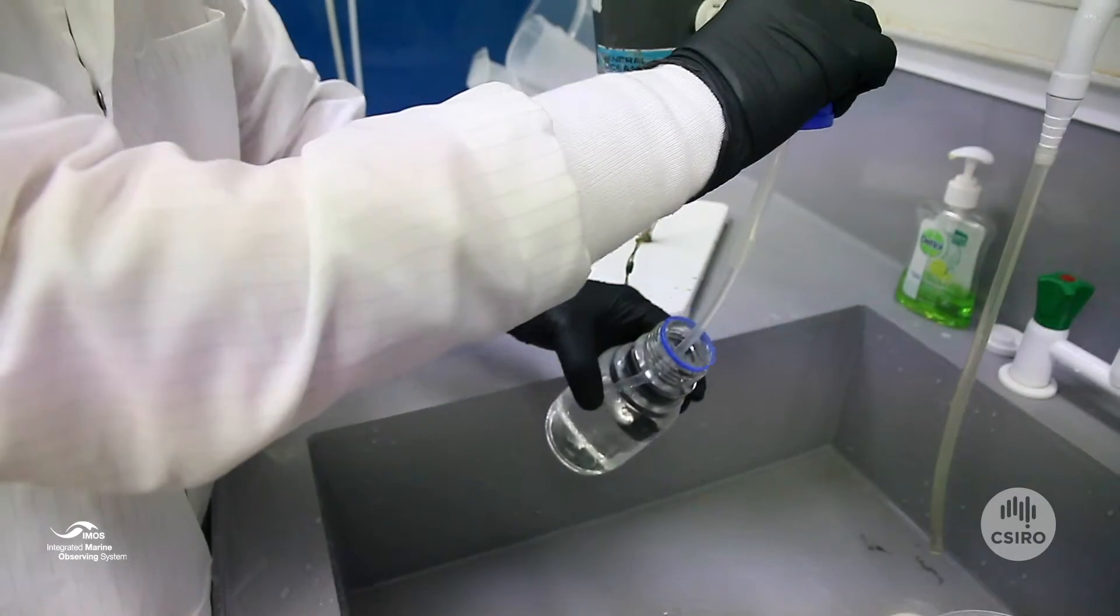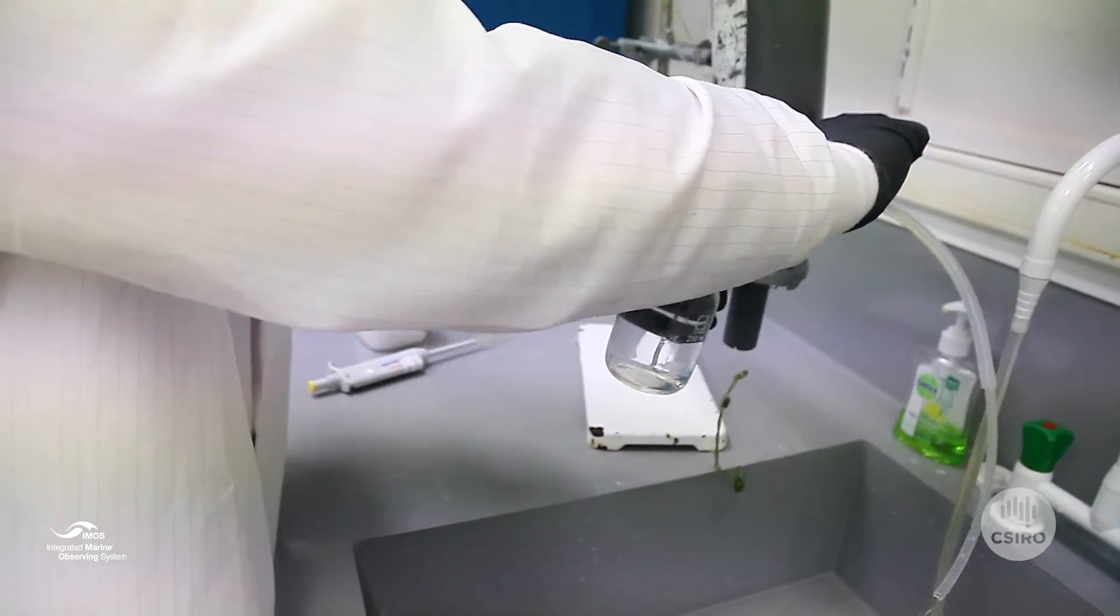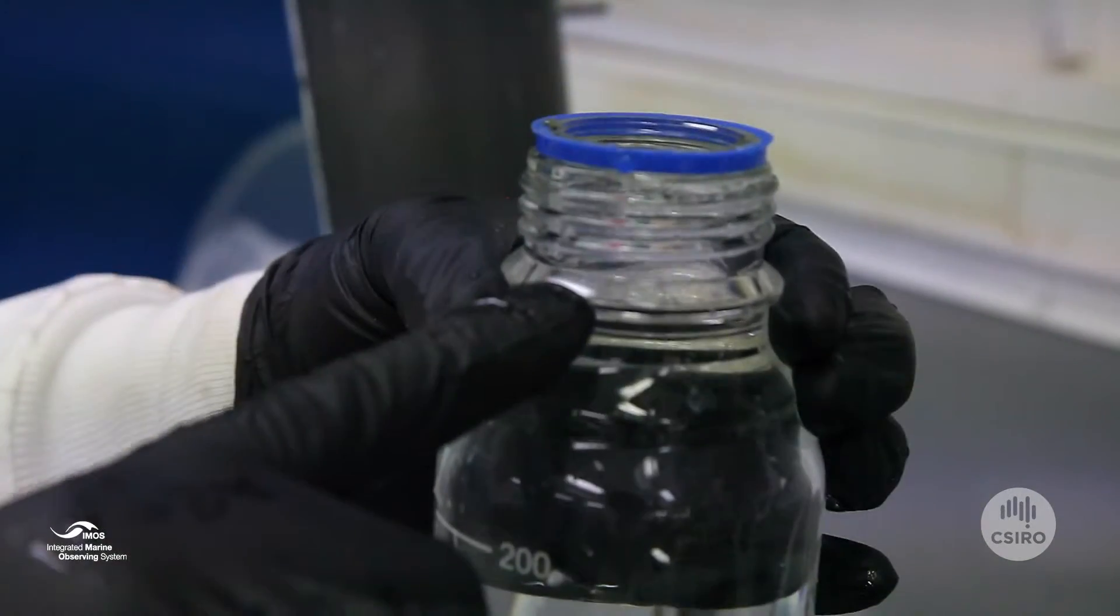Pinch the tube to stop the flow, and then pull out the spigot to stop the flow from the Niskin. This time you'll need to pour out some sample to achieve the right level. The right level is just at the glass ring.